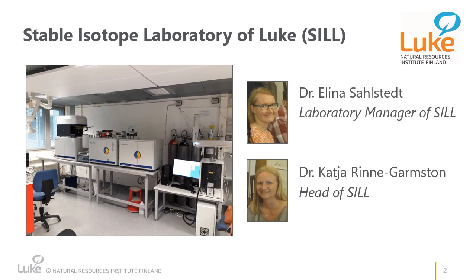And in this figure, you can see the lab and the IRMS here, and the laser ablation system here on the left-hand side of the instrument.